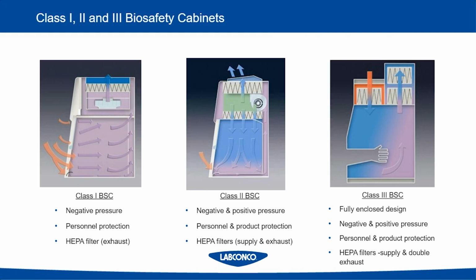For this next part of the presentation, we're going to focus on the Class II BSC and the different types. These are the most common biosafety cabinets by far, and so the different types are what we'll talk about next.